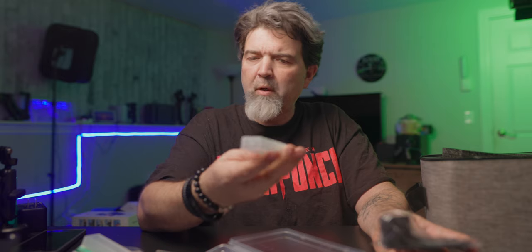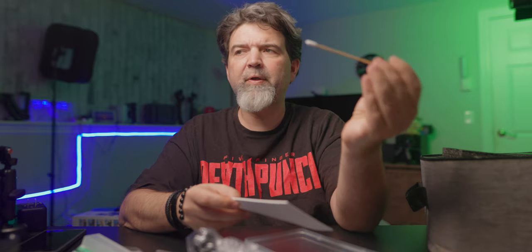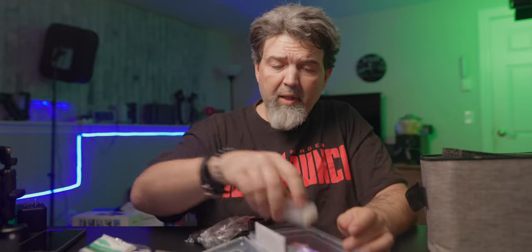You could be like a real scientist - probably not, but you're close. There are more samples - it's got some purple liquid in it. I'm hoping they tell you what any of this stuff is. It does have a picture of a camera on the front. There's lens tissue for cleaning and a little swab thing - you could swab your nose but you probably shouldn't. This all somehow goes back in here. I don't know if this is a stand or something to put your phone on.